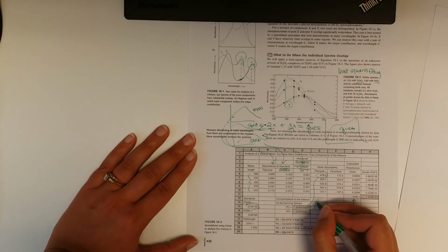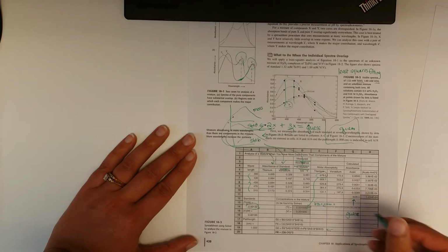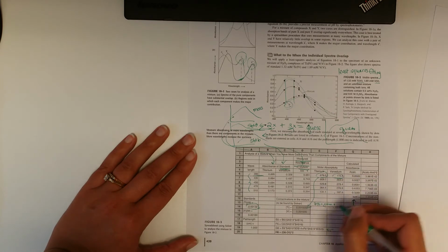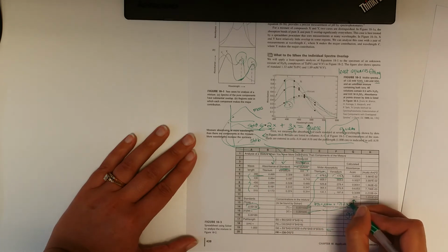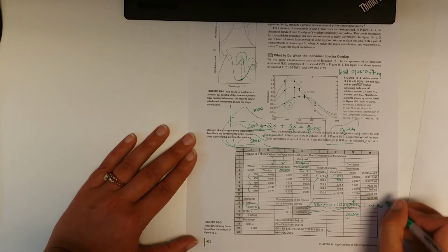So it's absorptivity of 678 times a guess plus the absorptivity at that wavelength, we work on the wavelength here, of vanadium, 172.5, times a different guess. Okay, so here's vanadium guess. We don't know what it is. They're probably not equal to each other. And that's going to spit out some estimated absorbance. The result of that goes in this column.